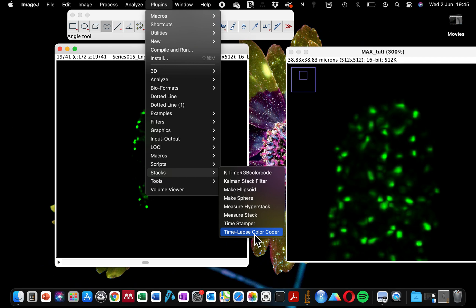I'm going to be using the two different ones and then you can see the different things that they do. They perform similar functions, just that one of them has an extra function which you might be interested in.